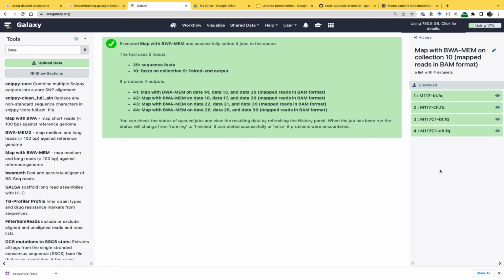If you're doing a genome-based RNA-seq, you can do RNA-seq, but usually when you're interested in gene expression, you're actually not mapping against the genome, but you do pseudo-alignment against actual transcripts. So there's a different tool for that. Maybe you heard of these tools. It's tools like Kallisto or Salmon, these kinds of tools. But right now, I'm going to variants.